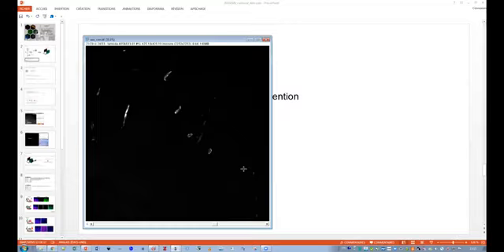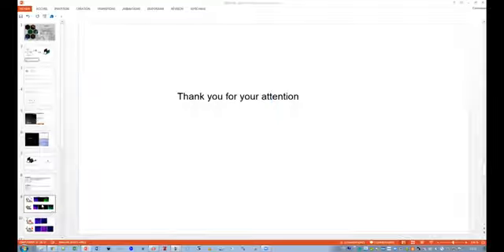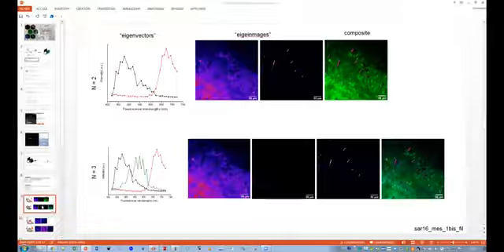Yeah. Okay. Thank you. And could you get the superimposition of all the spectra that are represented by a given eigenvector? Is it possible in order to see the diversity in a given class?